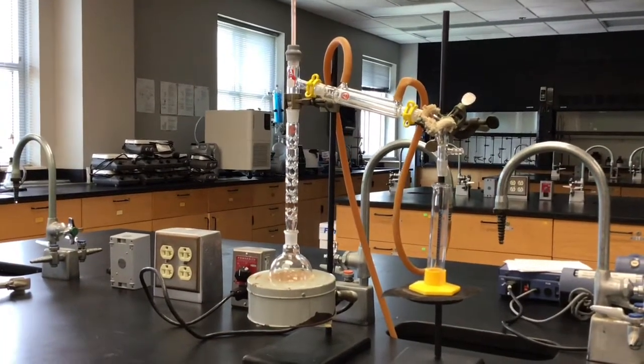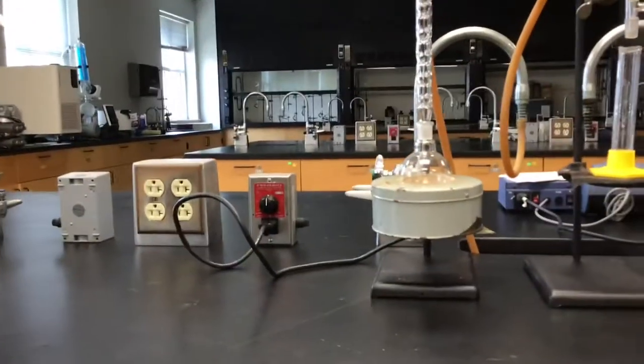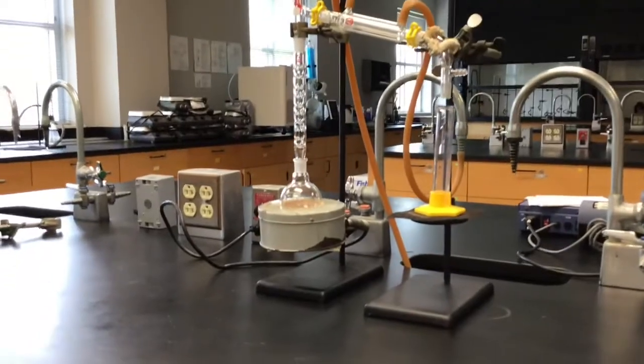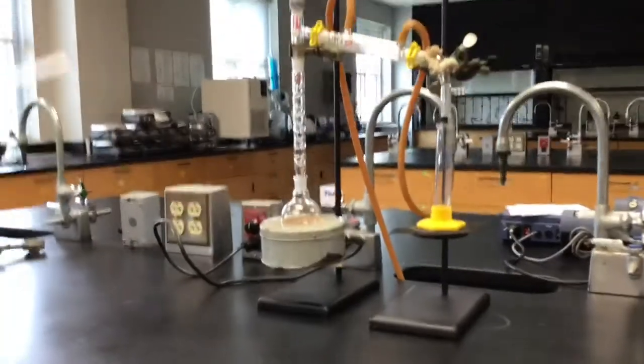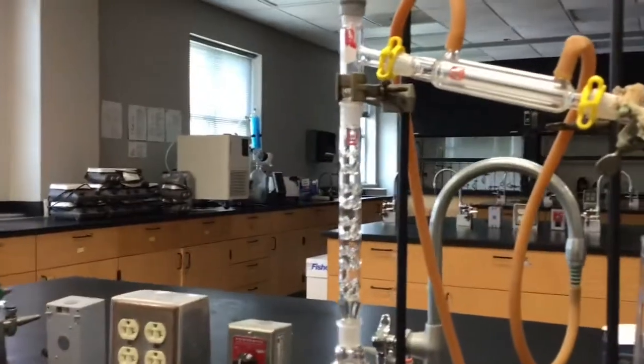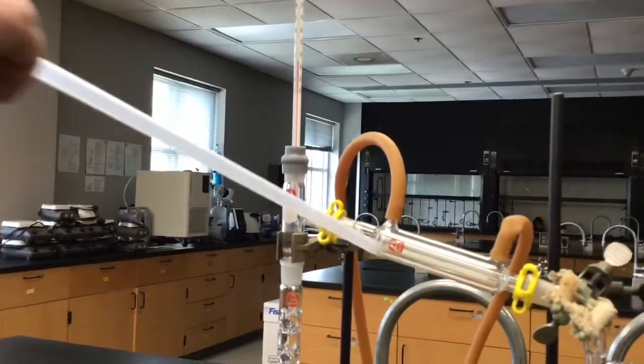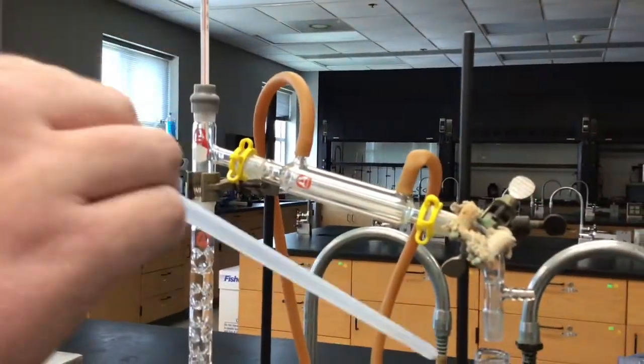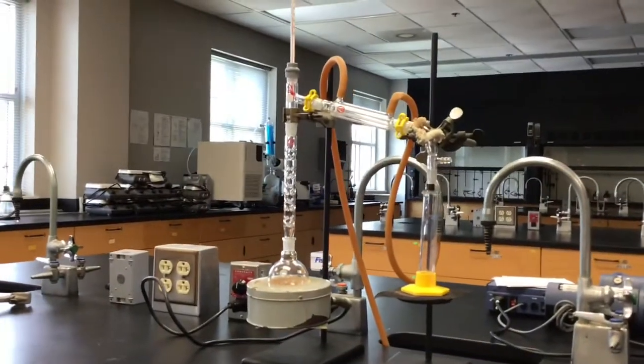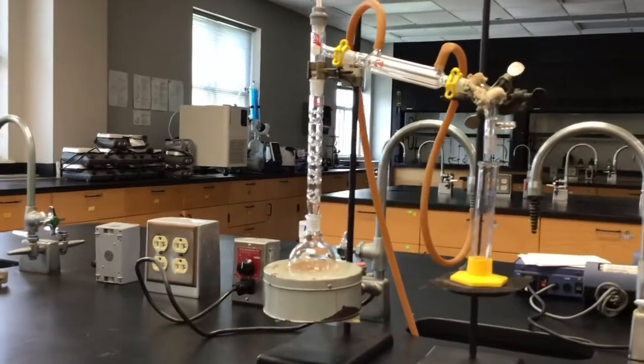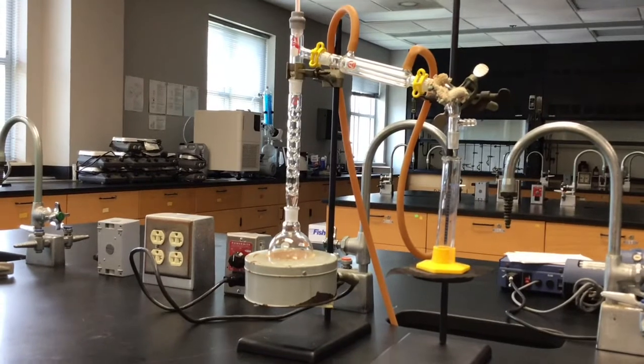So the general overview of this apparatus is we have the heating mantle on the bottom which is connected to one of the red outlets over here that has a dial on the side. It has to be connected to the red outlet and then you have the pot that has the solvent on the inside that you're intending to distill, then your fractionating column, your Y joint on the top which is attached to your thermometer, and then you have your condensing column, and then you have your output and your distillate collector on the side. So for a simple distillation the only difference in the apparatus is removing the fractionating column. So you literally take the piece out, shift it all up, and you have a very simple apparatus to work with.